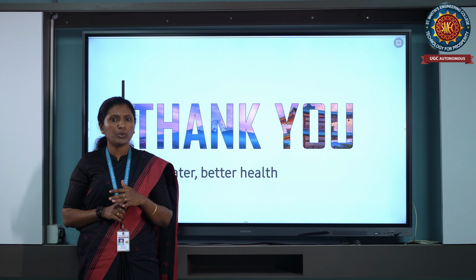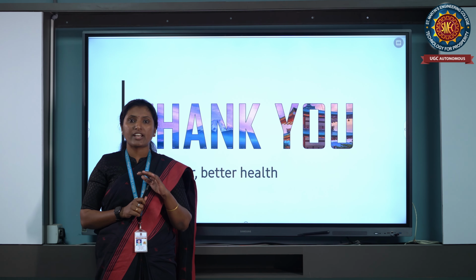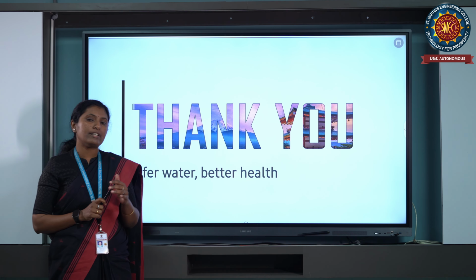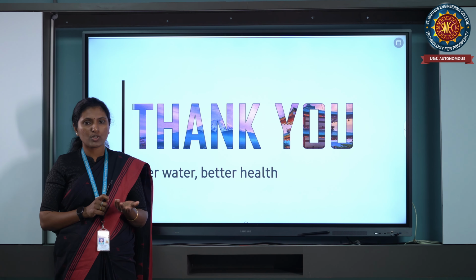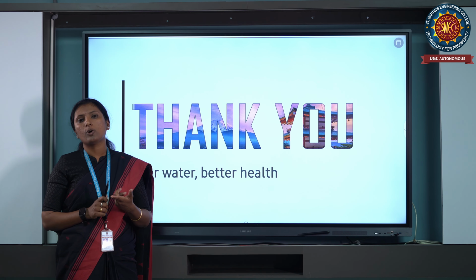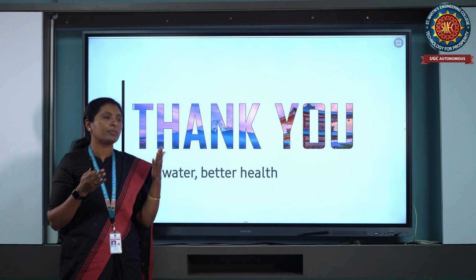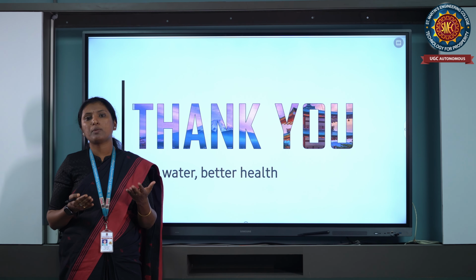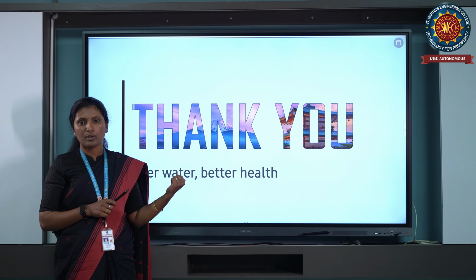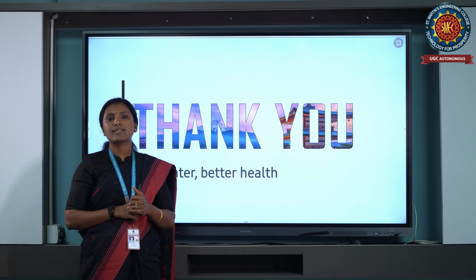After sedimentation, what will we do? If any suspended particles are there, we remove them by means of filtration. After filtration, we can also use disinfection methods if required. It's not part of this experiment, but we can use chlorination, bleaching powder, etc. After disinfection, the purified water can be used for household purposes. Okay, so this is about the determination of fluorine content present in water by the ion selective electrode method.